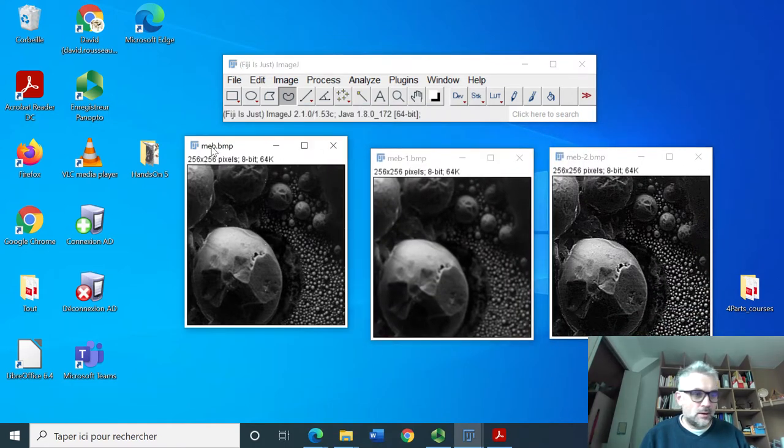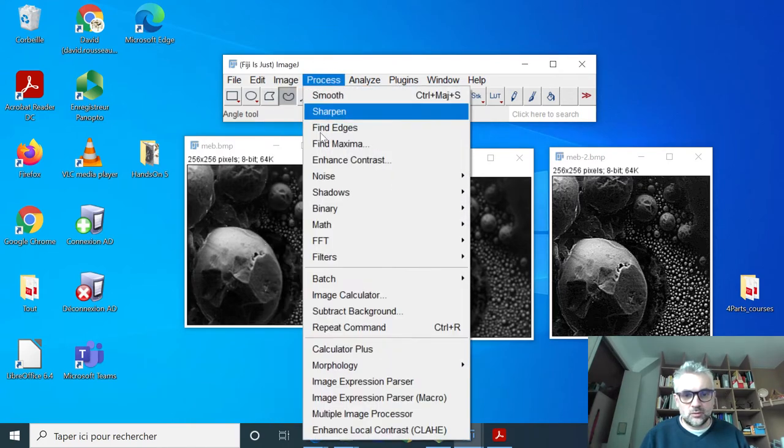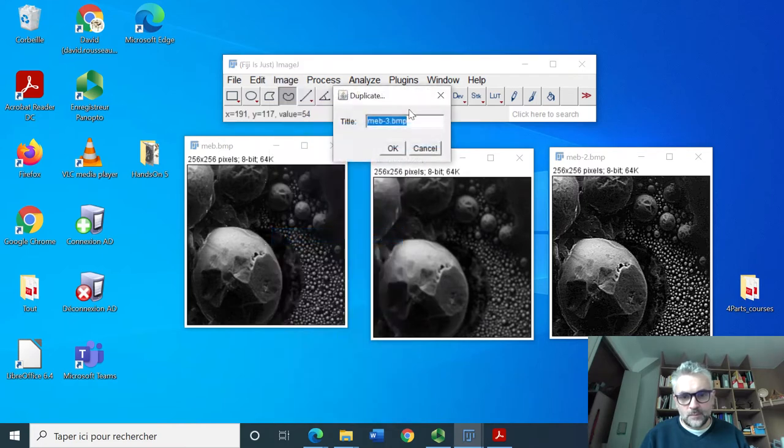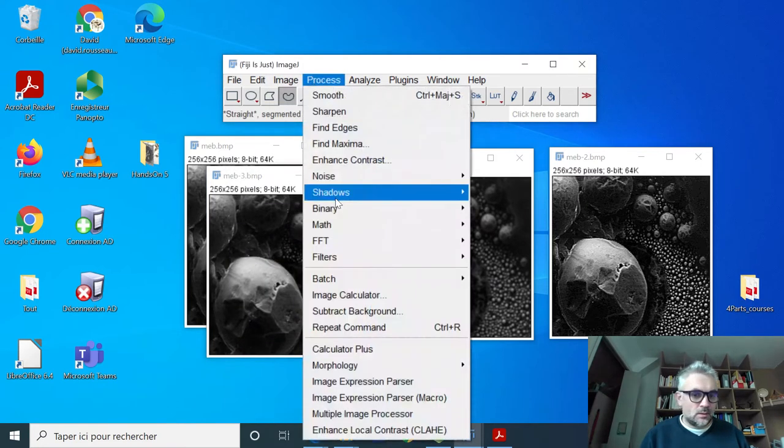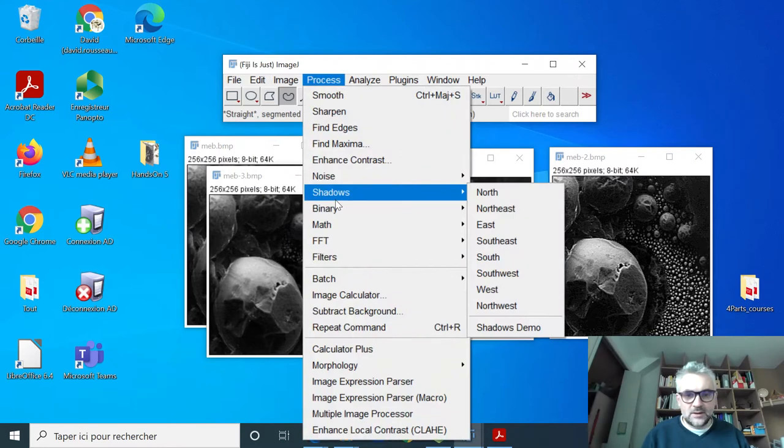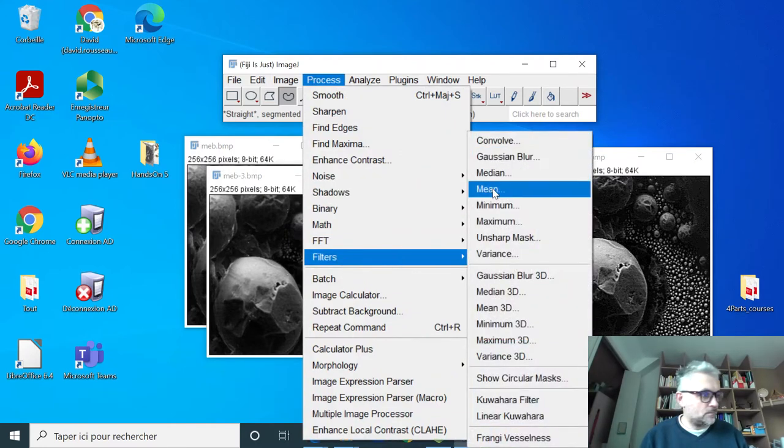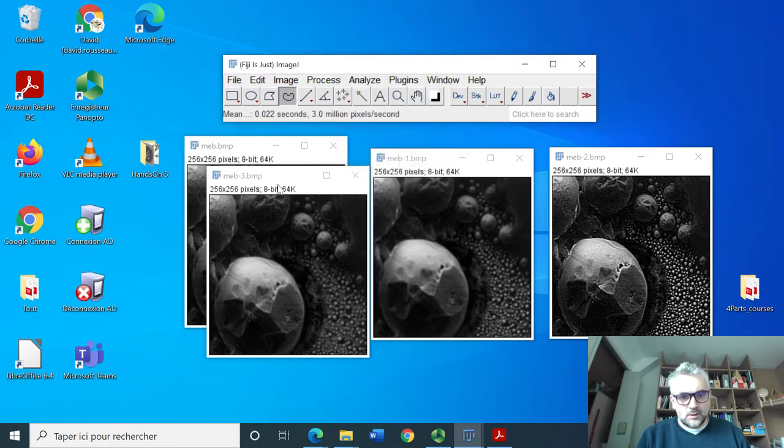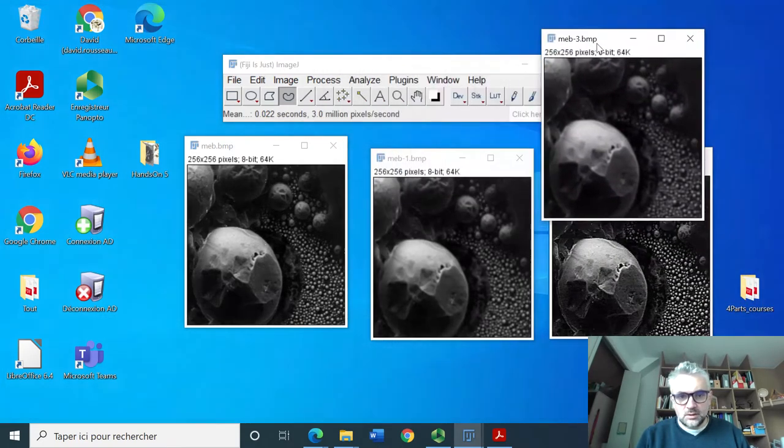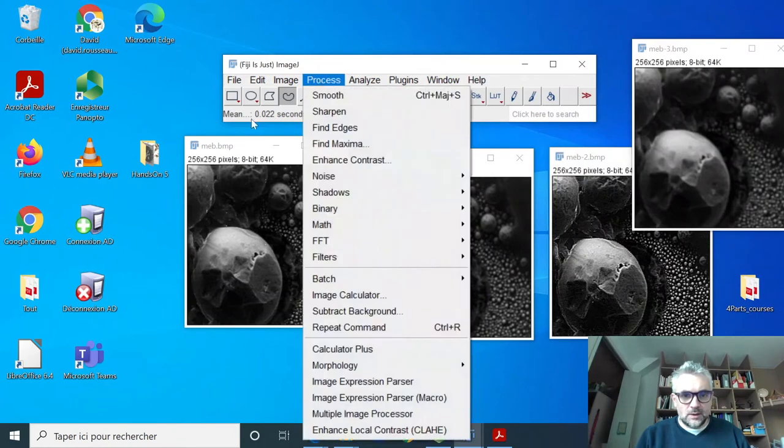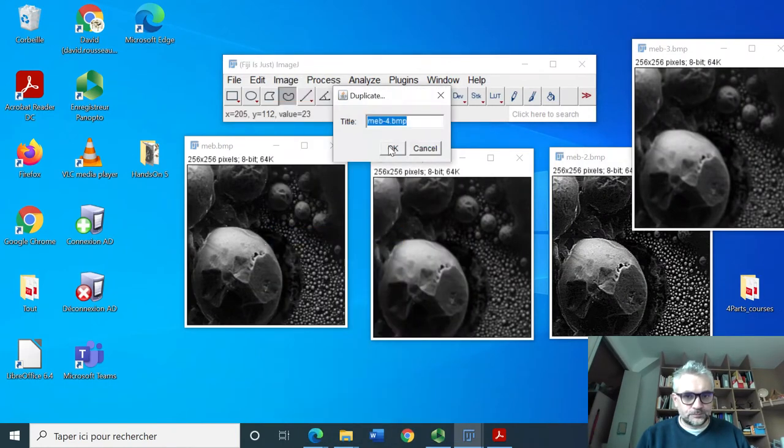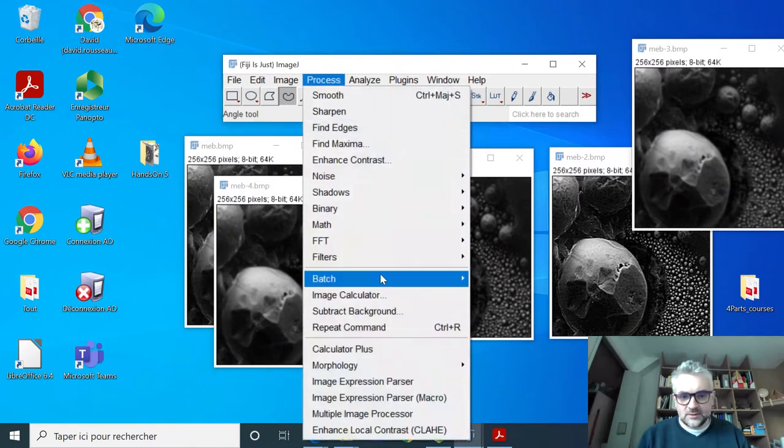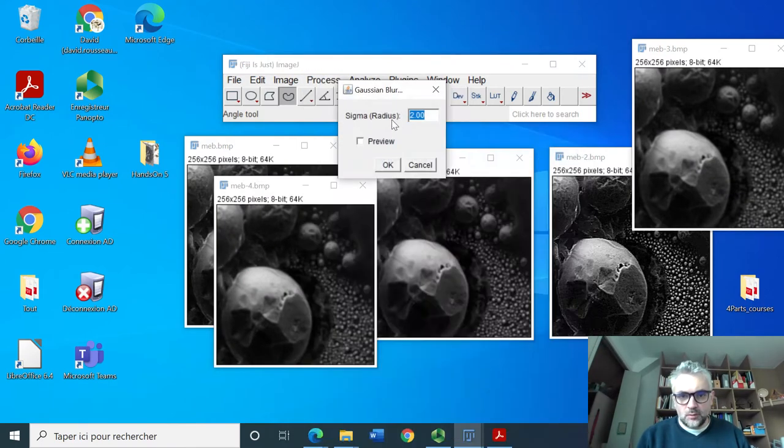We will duplicate again this image twice and process filter mean with a radius of 1.5. This is the image and one last image duplication. This is for process filter gaussian with also radius one.